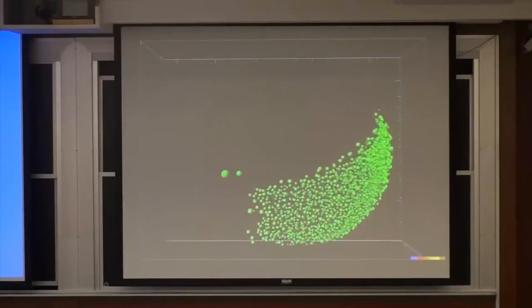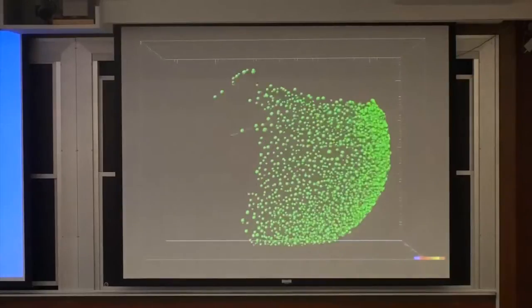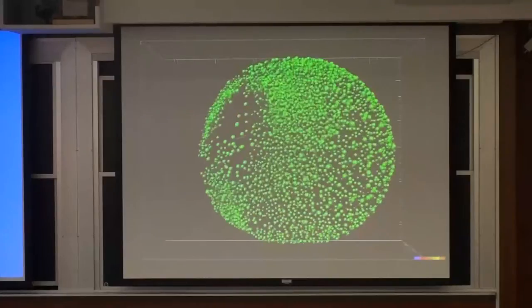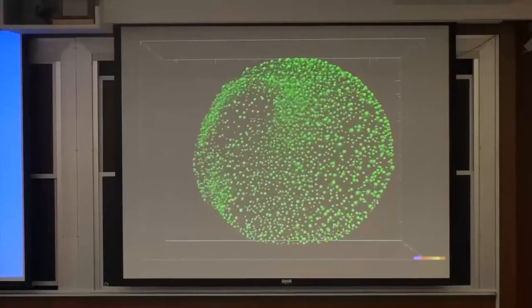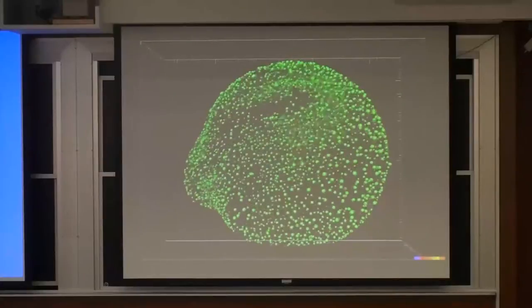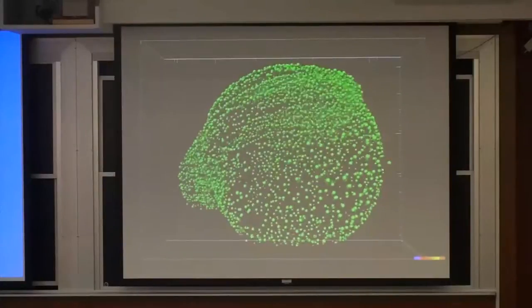So we can also do the quantitative biology I mentioned. You can track those cells. You can find the coordinates of each of them. And you can see the tissue morphology of how each of the cells is moving in a coordinated manner.